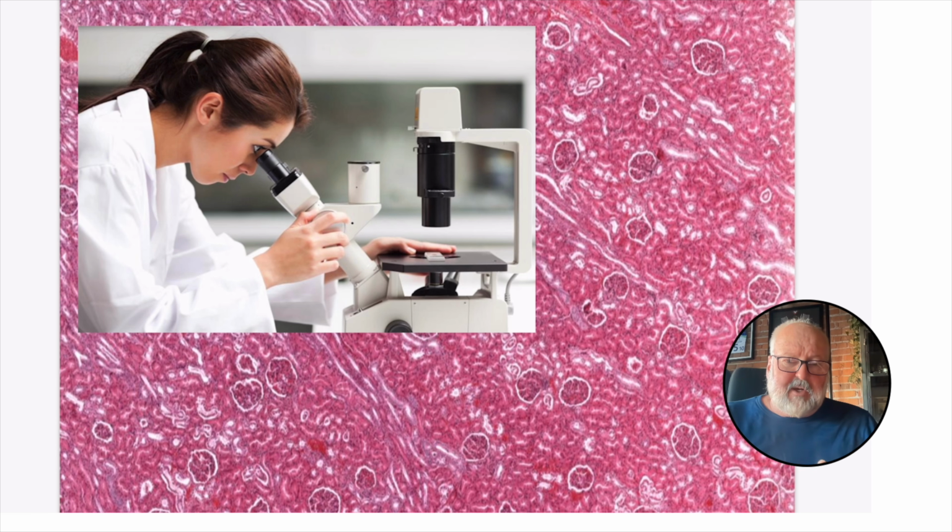Look at the classifications. When you're looking at histological sections, tissues, you really want to have a checklist in your brain. So let's run through a checklist for epithelium, and also let's look at some examples. So let's head in there.